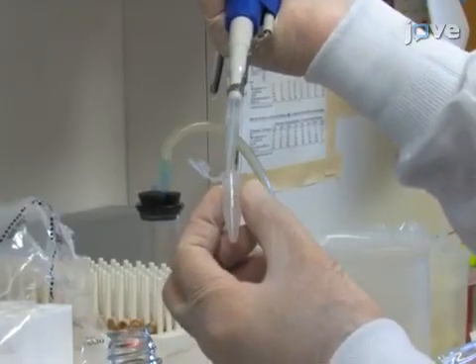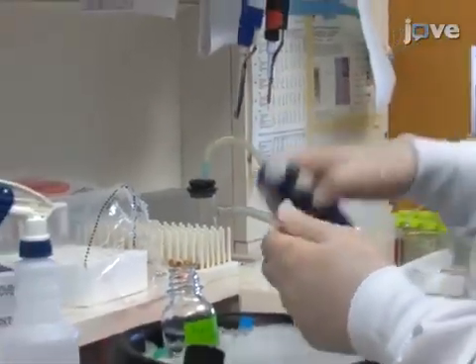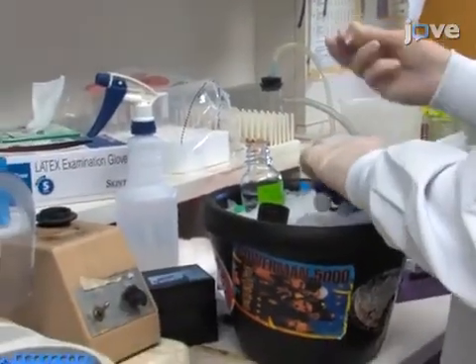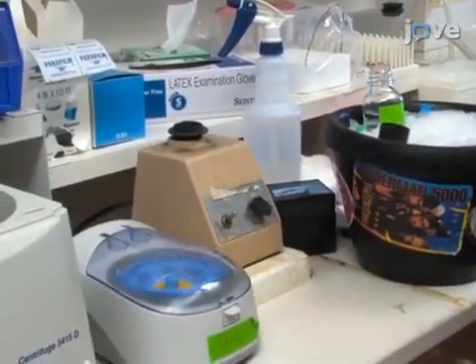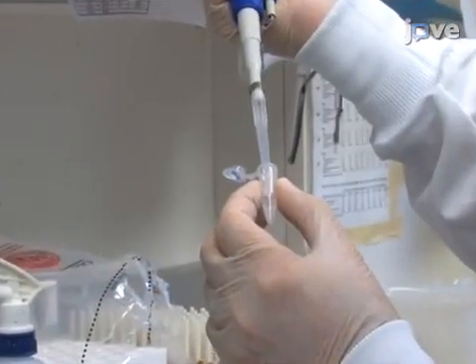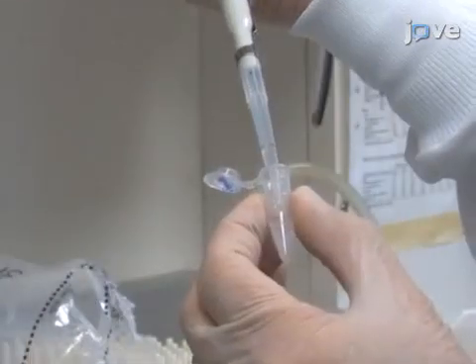Wash protein A sepharose beads 2 to 3 times by adding lysis buffer and then touch spinning at 4 degrees Celsius for 30 seconds to 1 minute at 5000 times G. Then remove the supernatant with a pipette and re-suspend the beads in buffer.